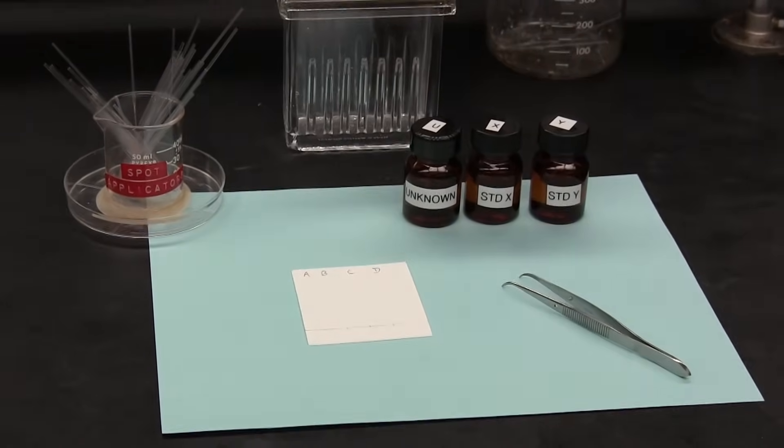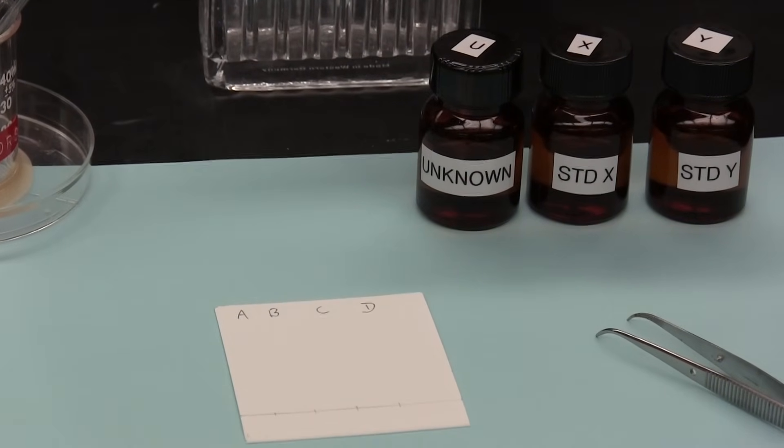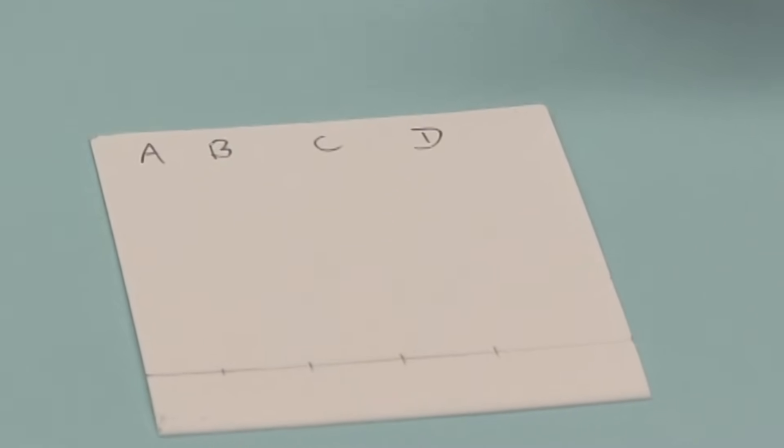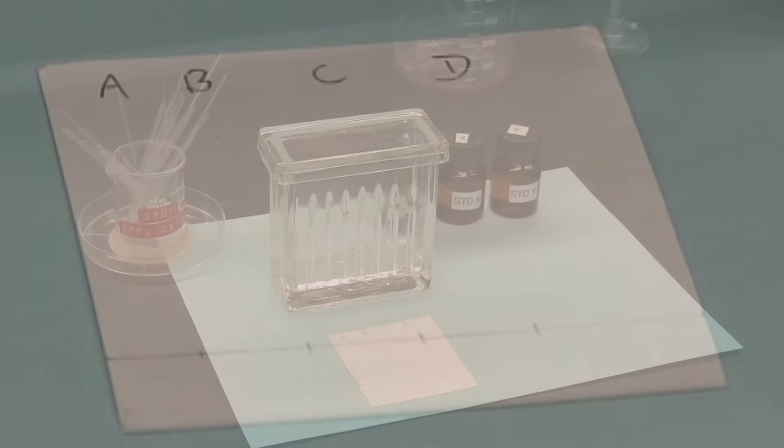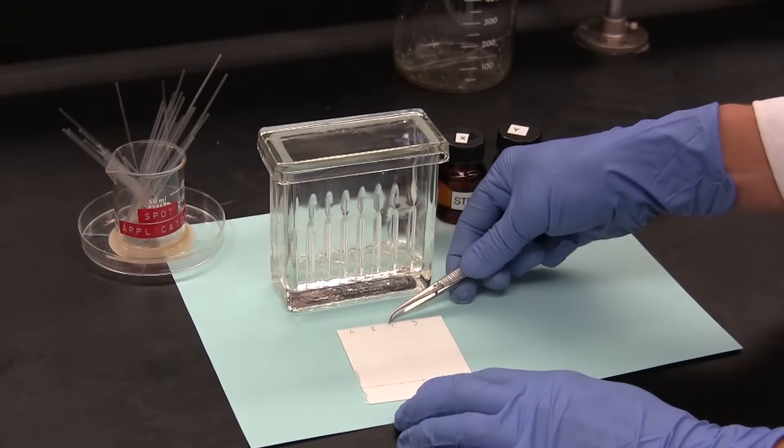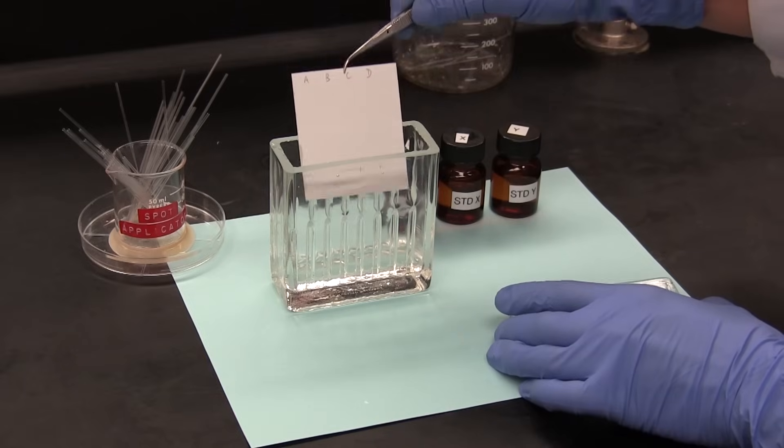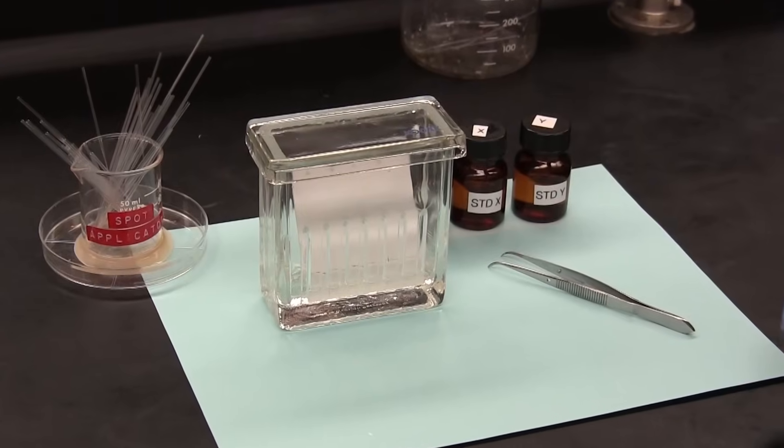Separation occurs on a thin layer of silica on top of a solid support, such as a sheet of glass or a sheet of plastic, as seen here. This is called the TLC plate. The properties of the silica and the properties of a solvent are used to draw the components up the plate. Differences in the properties of the components in the mixture mean that each component will travel up the plate at a different rate, and this causes a separation.